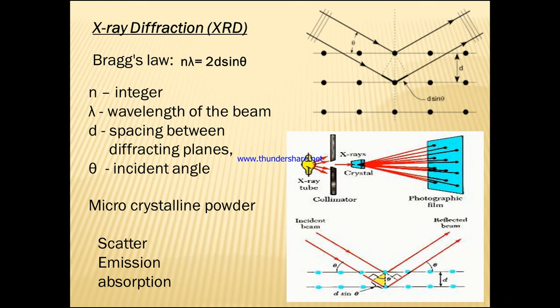For this purpose we are going to have this goniometer. With the incident ray which falls on the sample, it produces constructive interference. When the rays fall on this, we get an interference. So these are all maintained by using the goniometer here, which is used for maintaining the angle, maintaining the X-ray to be monochromatic as well as collimated, and to pass towards the crystal and be diffracted towards the photographic film to get the analysis of the material here.